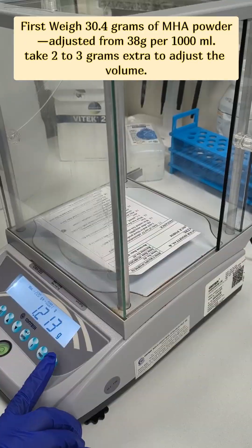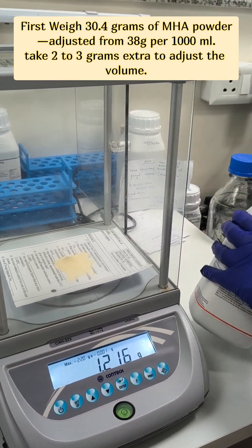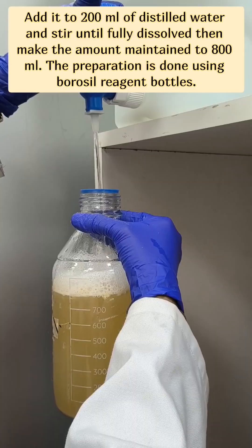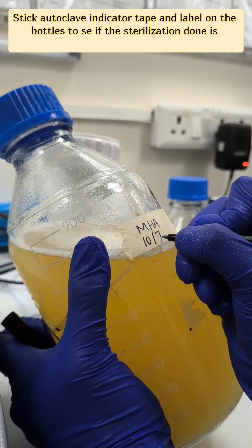First, weigh 30.4 grams of MHA powder, adjusted from 38 grams per 1000 ml. Add it into 200 ml of distilled water. Stick autoclave indicator tape and a label on the bottles to see if the sterilization done is effective or not.